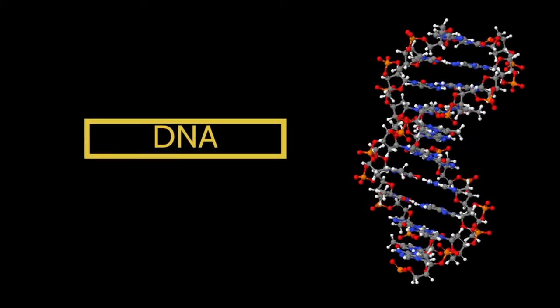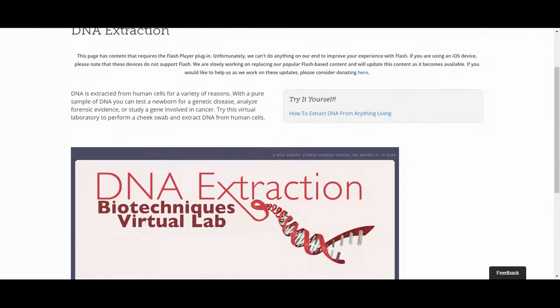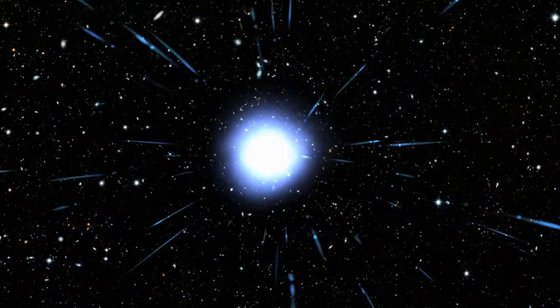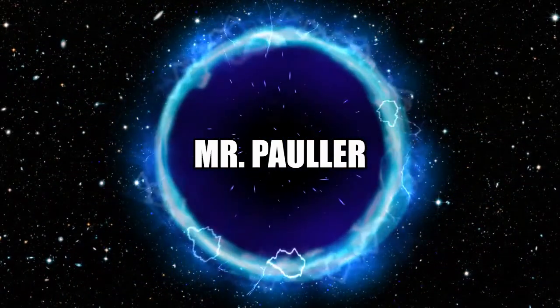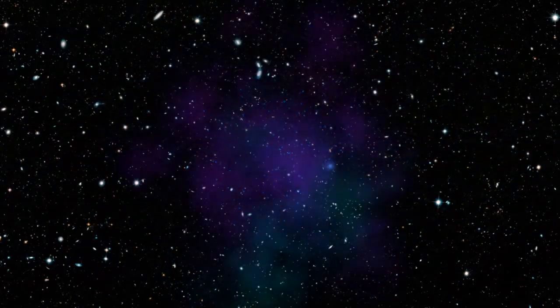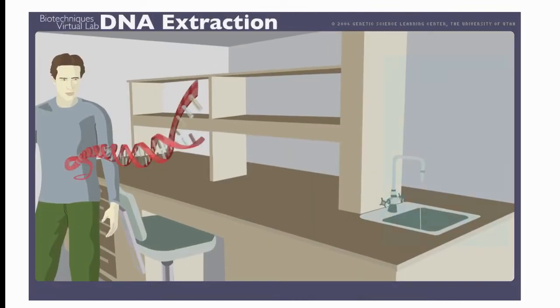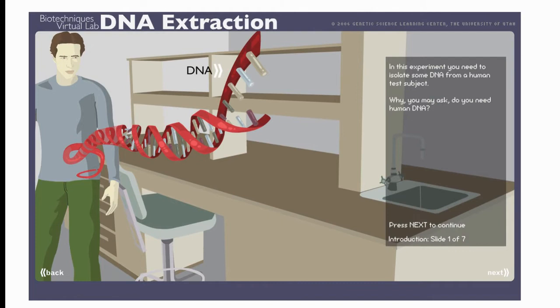In this video, I want to share a virtual DNA extraction lab with you from the Genetic Science Learning Center. Let's go into the lab to get started. Our goal in this activity is to collect a DNA sample from a test subject.